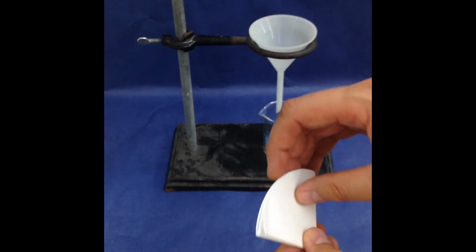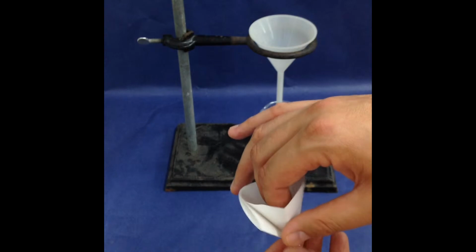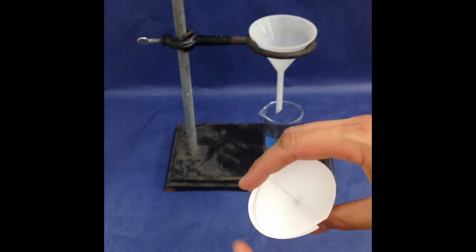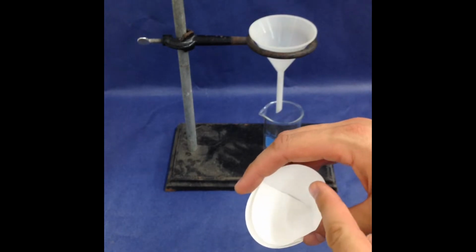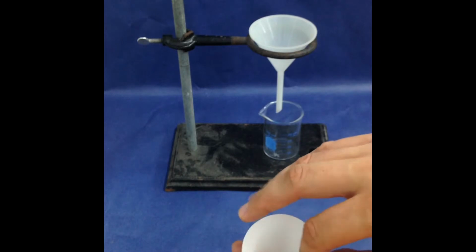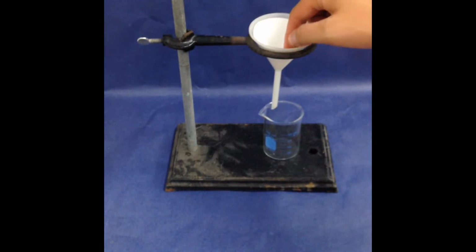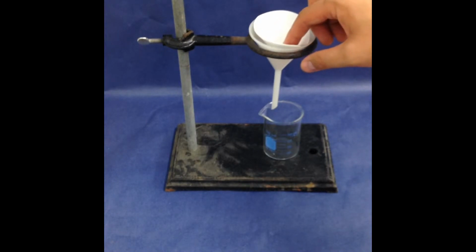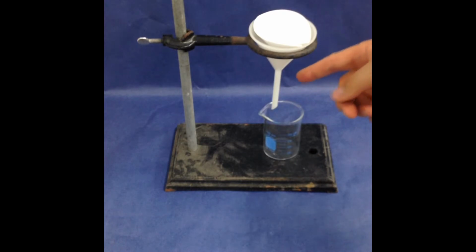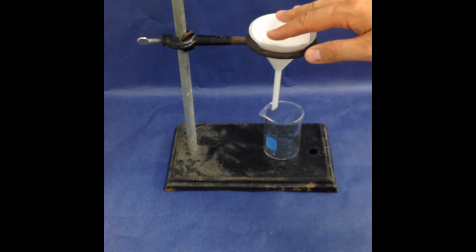So how do you make a cone out of this? Well, you take one of these foldings and you open it up like so. All right, it'll be a little uneven. You'll have a little more paper on one side, a little less paper on the other side, but that's the basic idea for making your paper funnel. That doesn't matter. You put the paper inside of the funnel, and now any liquid that passes through will go through the stem into your container, and any solids will get trapped by the paper.